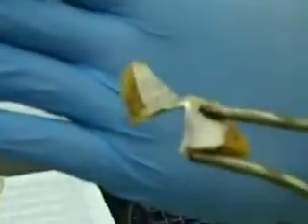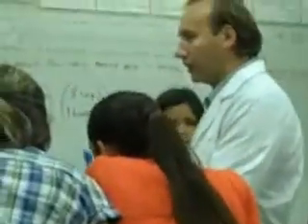Oh, look how shiny it is! You can see it's very shiny. Shininess! Now it's no longer that shiny because it's being exposed to the air.